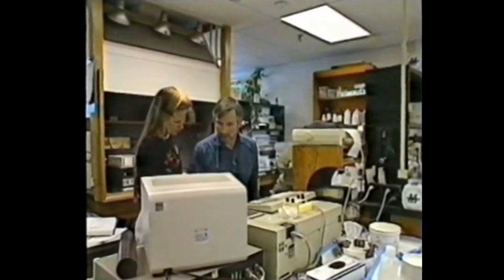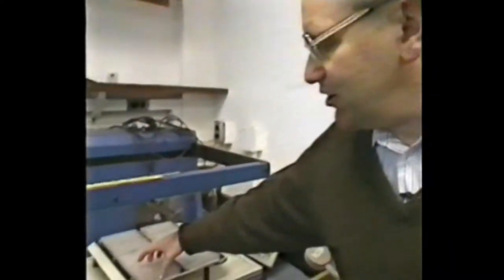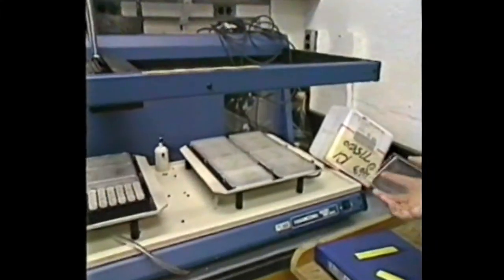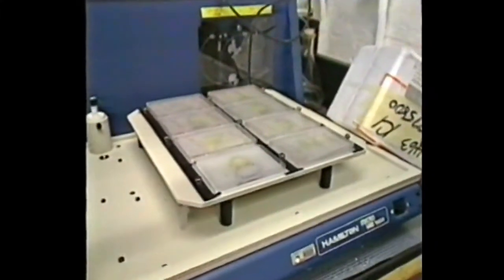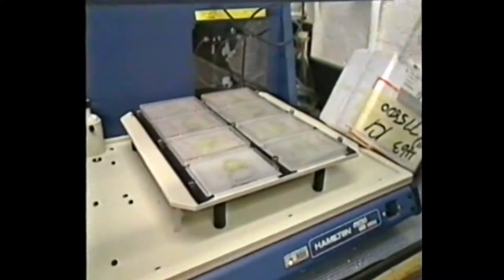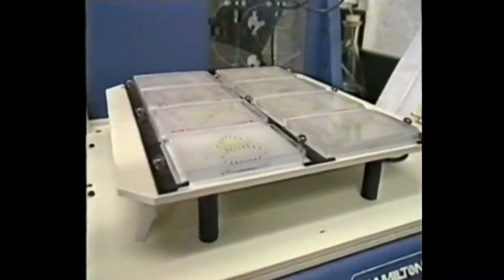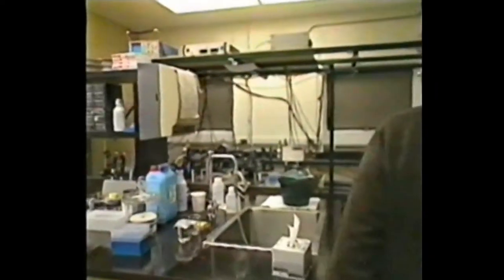We're coming here to a laboratory robot on which we have arrayed the 4,096 hexamers in 384 well microtiter plates. We're able to pick up automatically from any point in these 4,096 wells, hexamers for sequencing, and bring them to a place where sequencing reactions can be carried out. For reading the base sequences, Studier's group has designed a prototype capillary system.